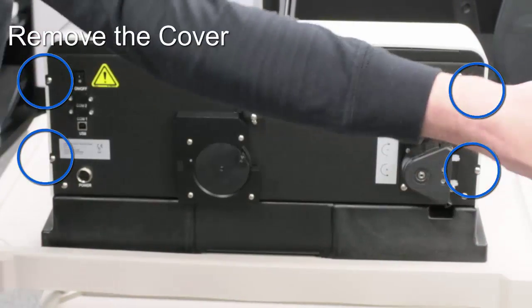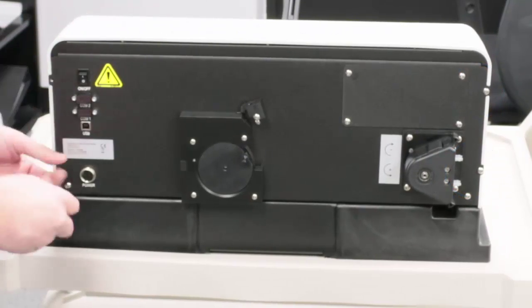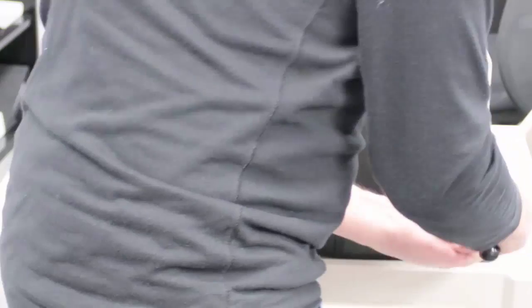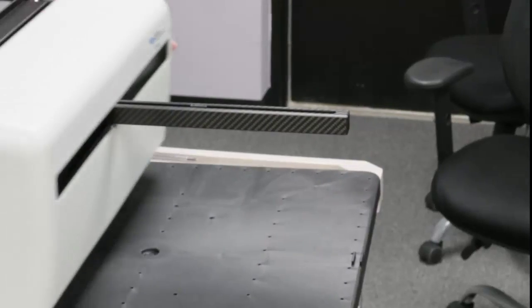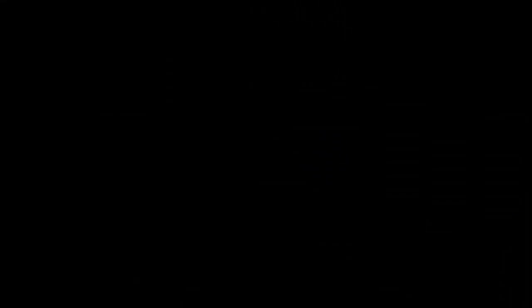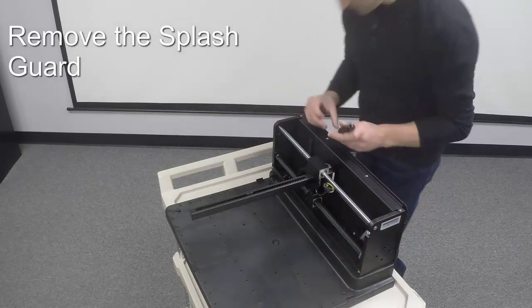The cover is held by four screws in the back. The splash guard is held by two screws on top and two down below.